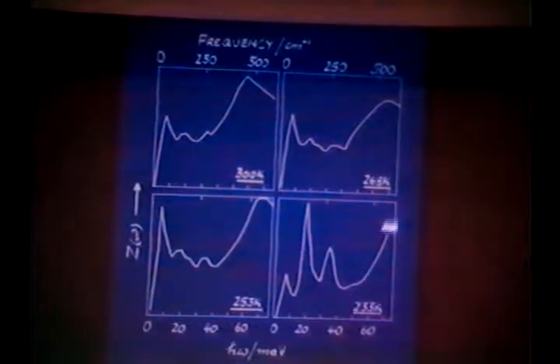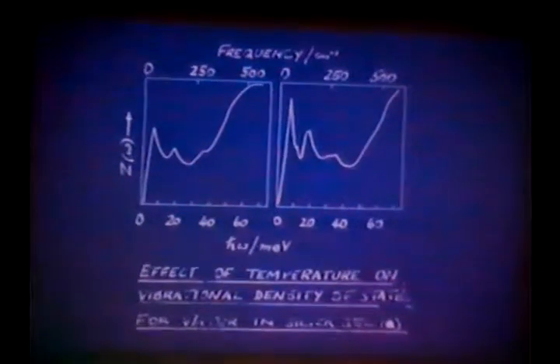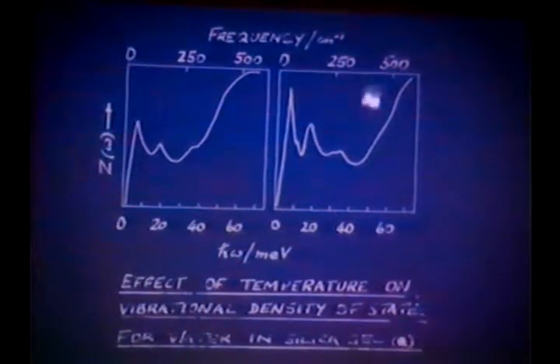And this position of the libration is very sensitive to hydrogen bonding. The point to note, though, is that we see changes in this band here, which has been assigned to hindered translational motion. We also see, when we get ice, this marked peak coming up here, which has been ascribed to a stretching mode of hydrogen bonds. These assignments perhaps are a bit sensitive, but the point to note is that we're getting ice in this situation here. For the higher water content, these are results for 300 and 265 K.